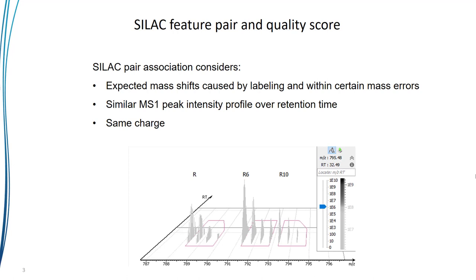First, are the peptide features separated by the expected mass difference and within the expected mass error? Do they share similar intensity profile across the retention time range? Also, are they the same charge? Meaning, do they have similar isotopic distribution?